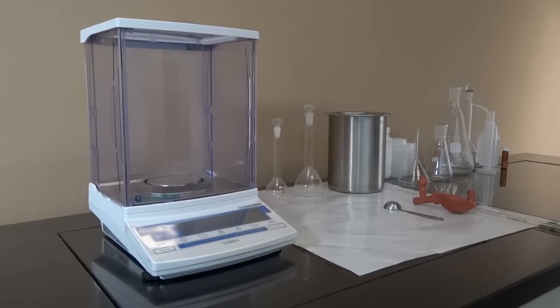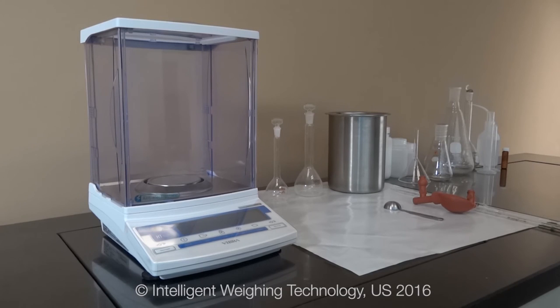Simple, stable, and efficient, the HT is an excellent balance for analytical weighing, allowing for a flexible workflow in a sophisticated laboratory environment.